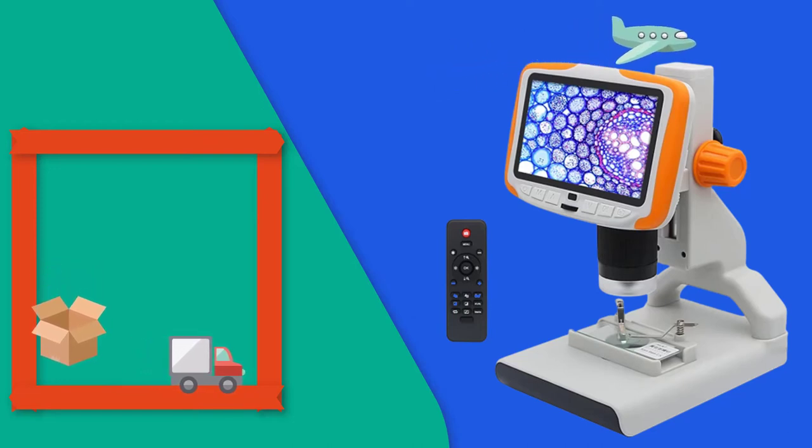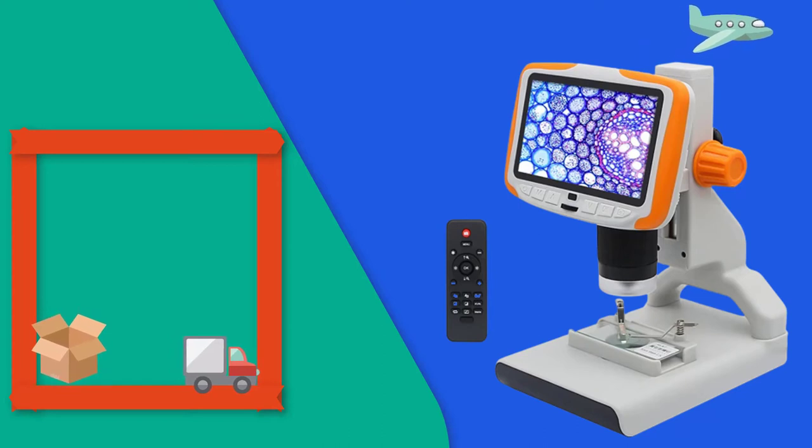Trinocular Microscope Zoom Stereo Microscope Head, Auxiliary Objective Lens, Microscope Camera Adapter.